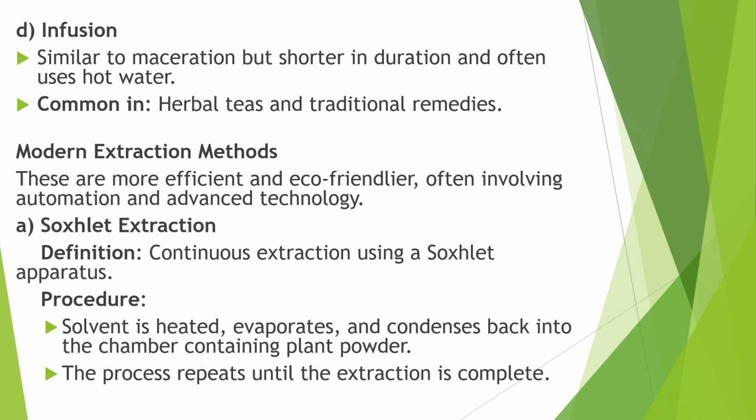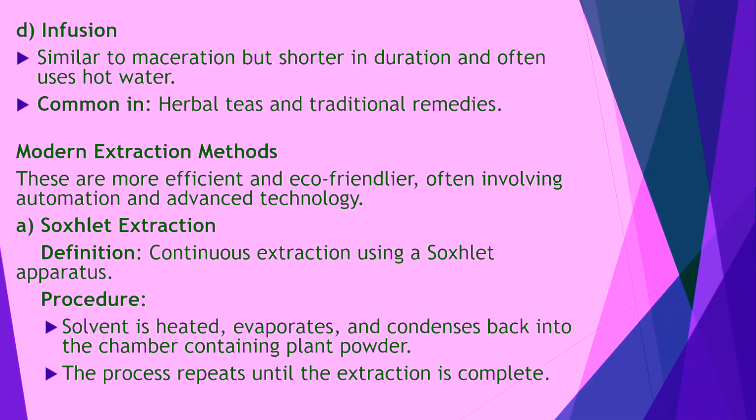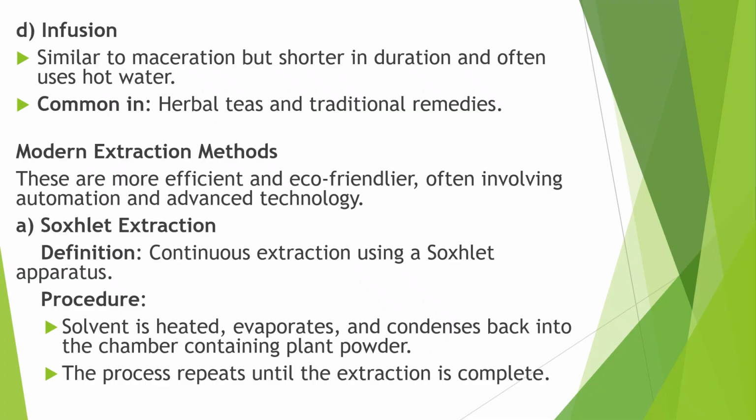And in case of hot infusion, you have to follow the same process, but the solvent you are using must be in a hot condition, but no direct boiling will be there. If I suggest you water as the solvent, then it will be much easier to understand. Just assume water as solvent. You have to take a specific amount of water as per the procedure, then boil it.